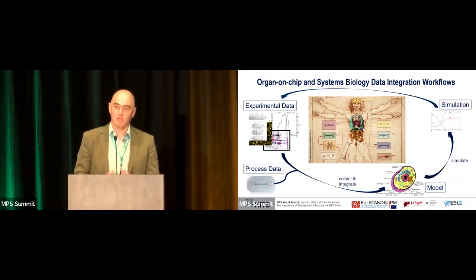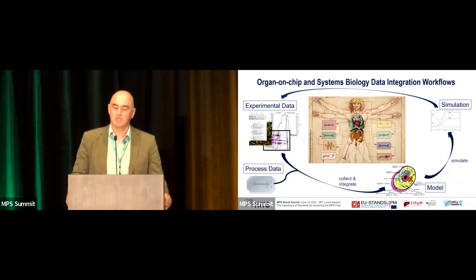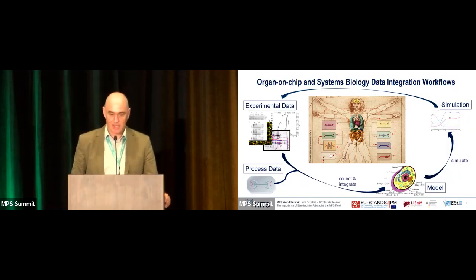can make a bridge also via the standardization, because when you then collect your data, then what in the end you might want to do is to simulate models. So you have to set up models. For that, you have to integrate all this data, and the data has to fit. And then when you simulate the data and go back to your experimental results and make refinements and eventually start a process again, yeah, that all needs a certain degree of standardization.